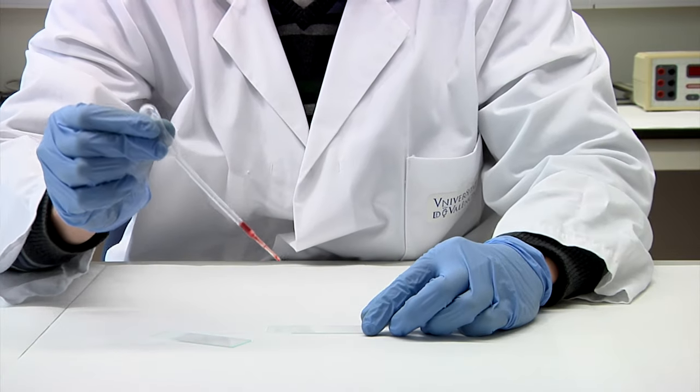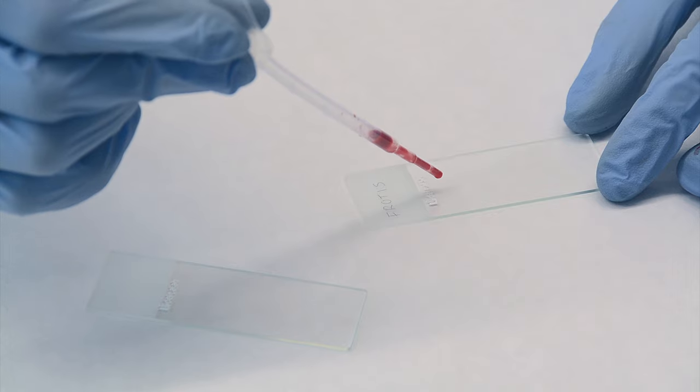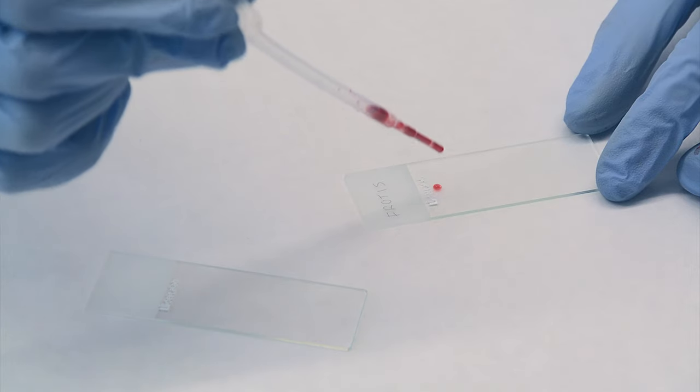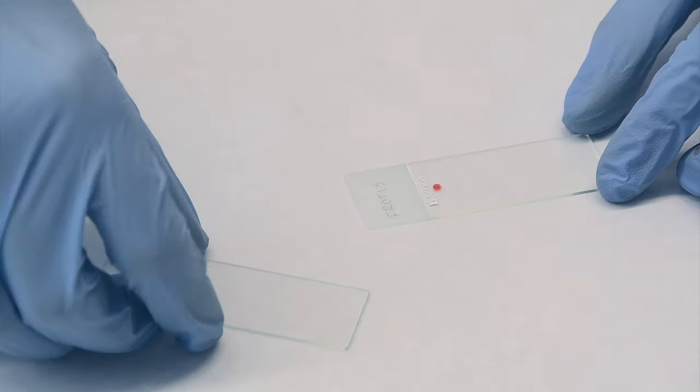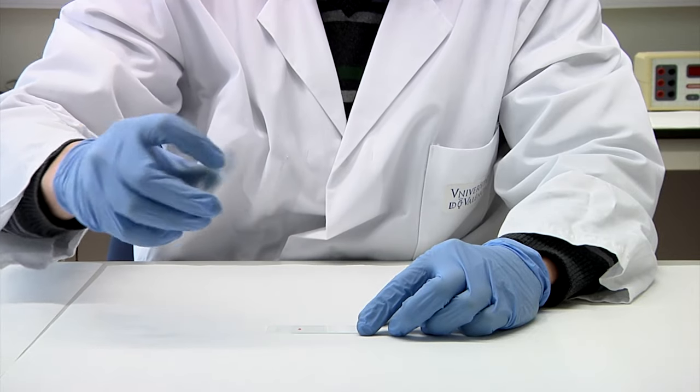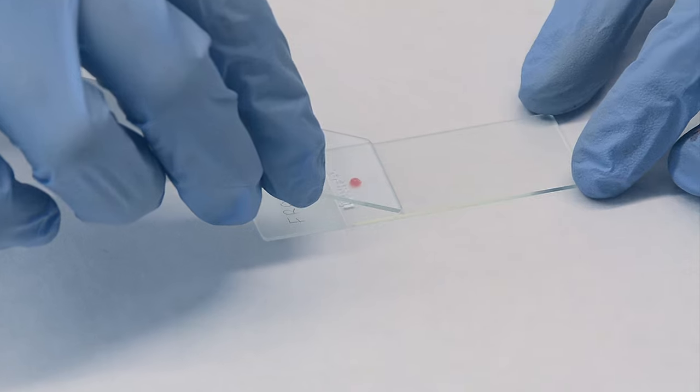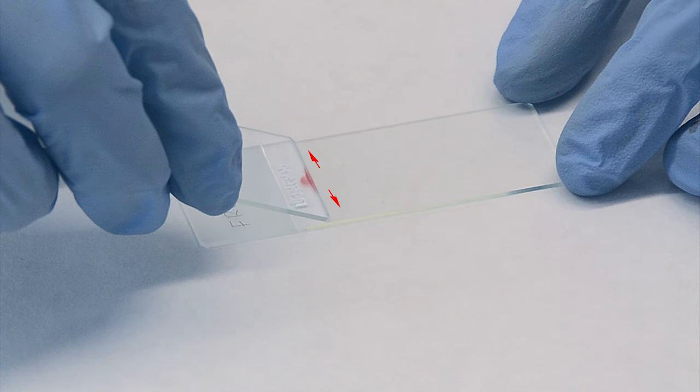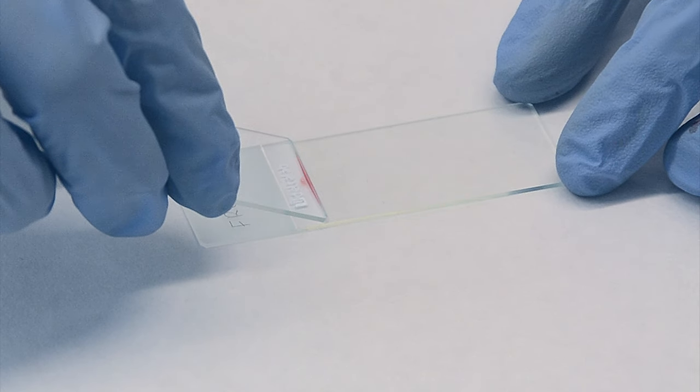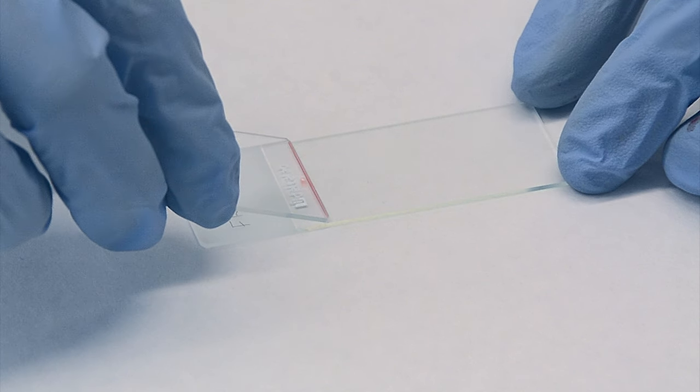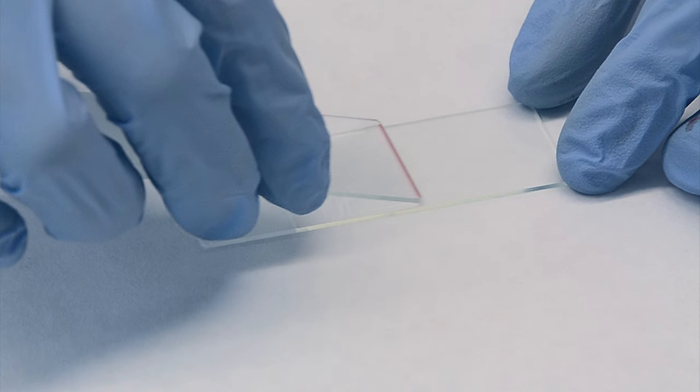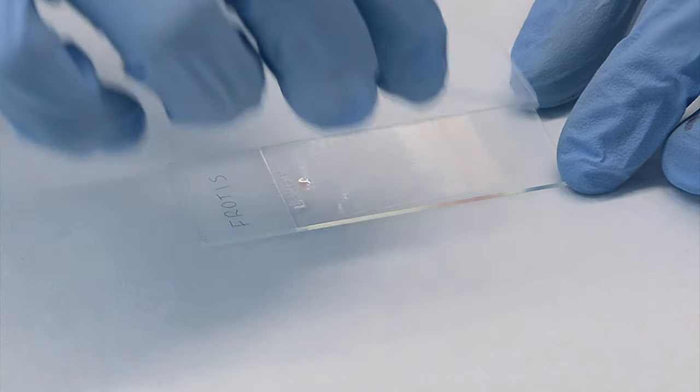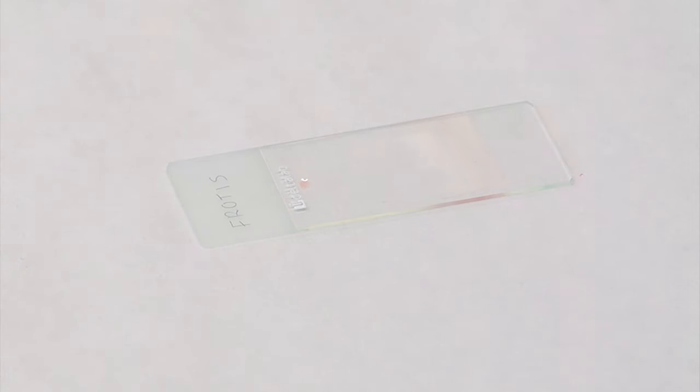A drop of blood is deposited at the end of the slide. Next, take another clean slide and holding it at an angle of about 45 degrees, touch the blood with one end of the slide, so the blood runs along the edge of the slide by capillary action. Push carefully along the length of the first slide to produce a thin smear of blood. It is very important to do it quickly and uniformly. Once the smear is done, let it dry in the air.